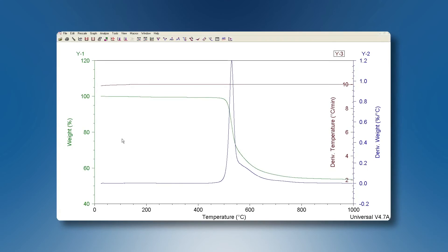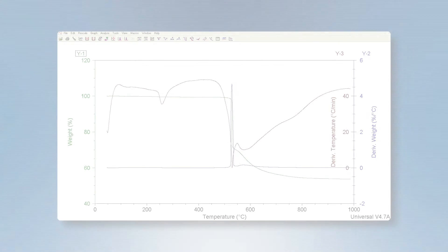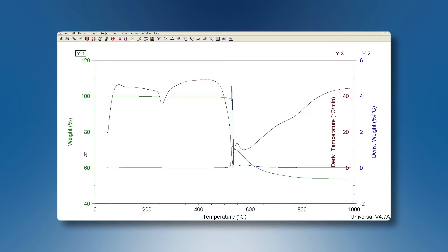Now let's take a look at the results. This experiment shows the degradation of a high-temperature polymer. This is a standard experiment, not high-resolution. In this standard TGA experiment we can see that the heating rate is constant over all the experiment — 10 degrees per minute.